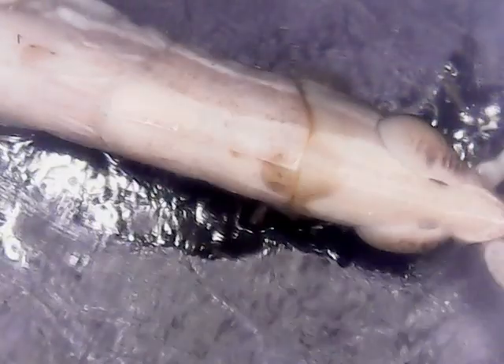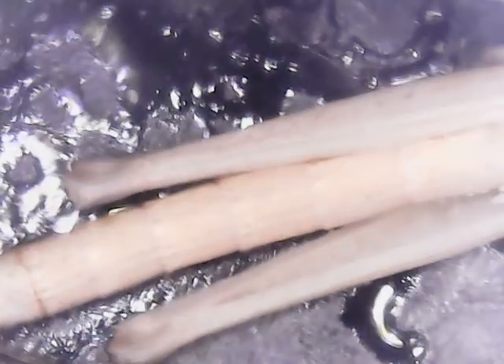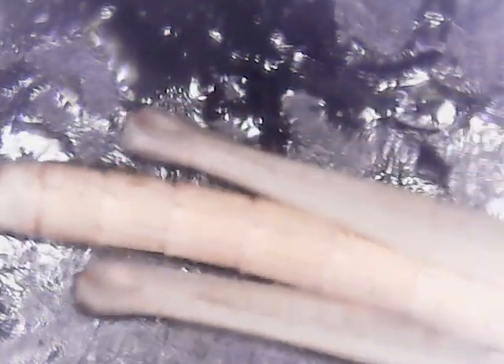Now this is a grasshopper — it's kind of a strange one. Arizona, we have some strange bugs. I got this guy outside my dad's house a while back. He looks like a stick bug almost, and he's missing part of — or maybe part of both — his jumpy legs. He was jumping beforehand, but he might have actually torn it off or done something dumb.